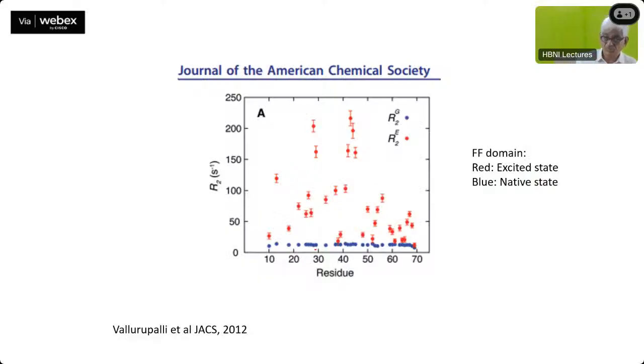Okay, I think we'll. So yeah. For each of these residues, there can be several conformational states. If it is exchanging, let us say around residue number 39 or so, you can see 1, 2, 3. No, these are at different places. They are not the same residues. Around 40, there are 3. They are not on the same line. Okay, 40, 41, they are different. There is a possibility that it can have.